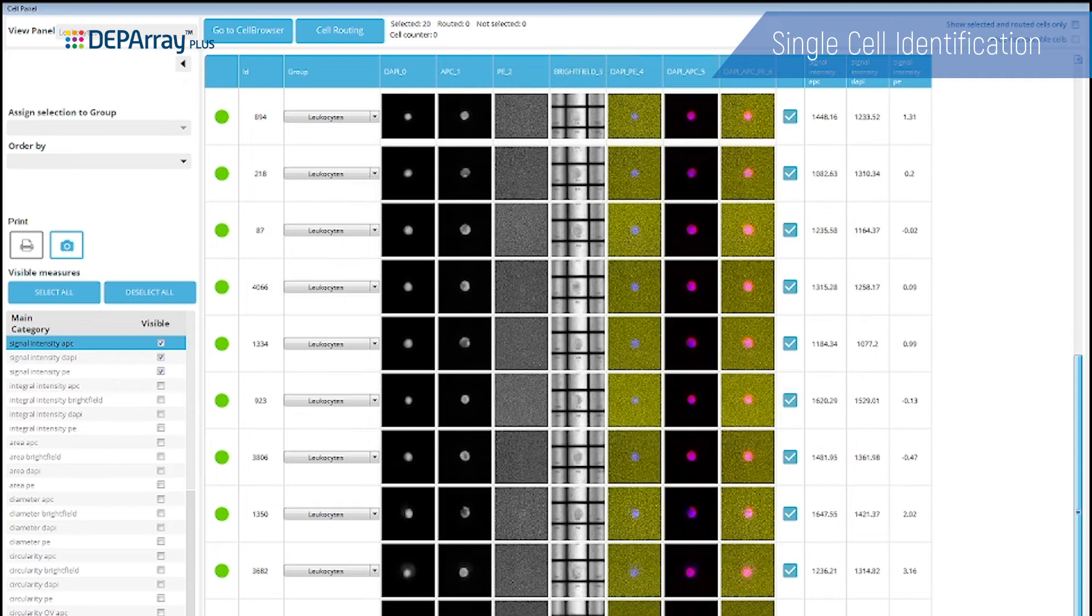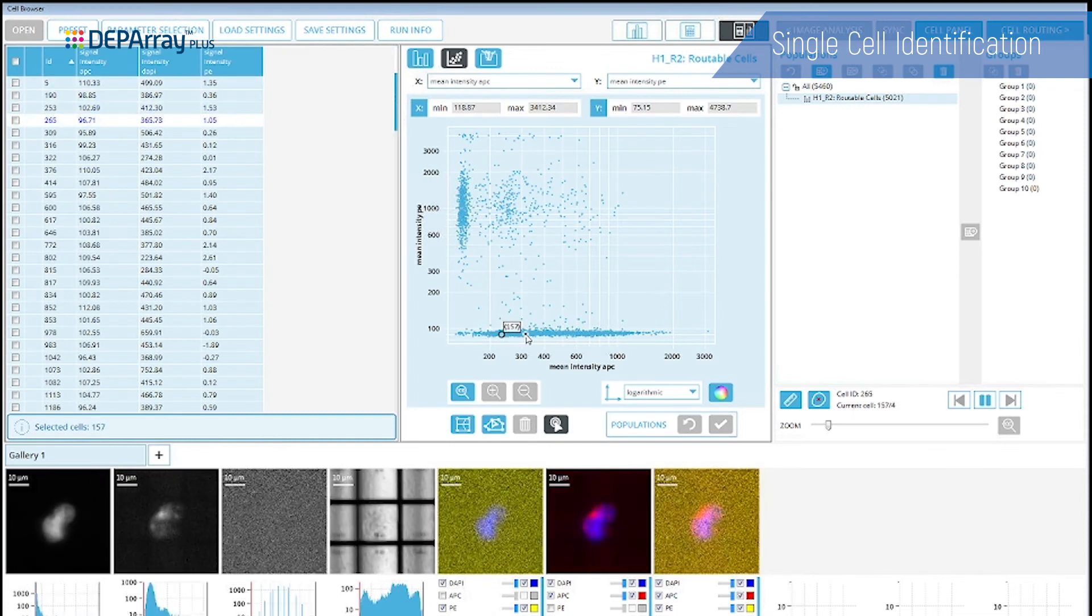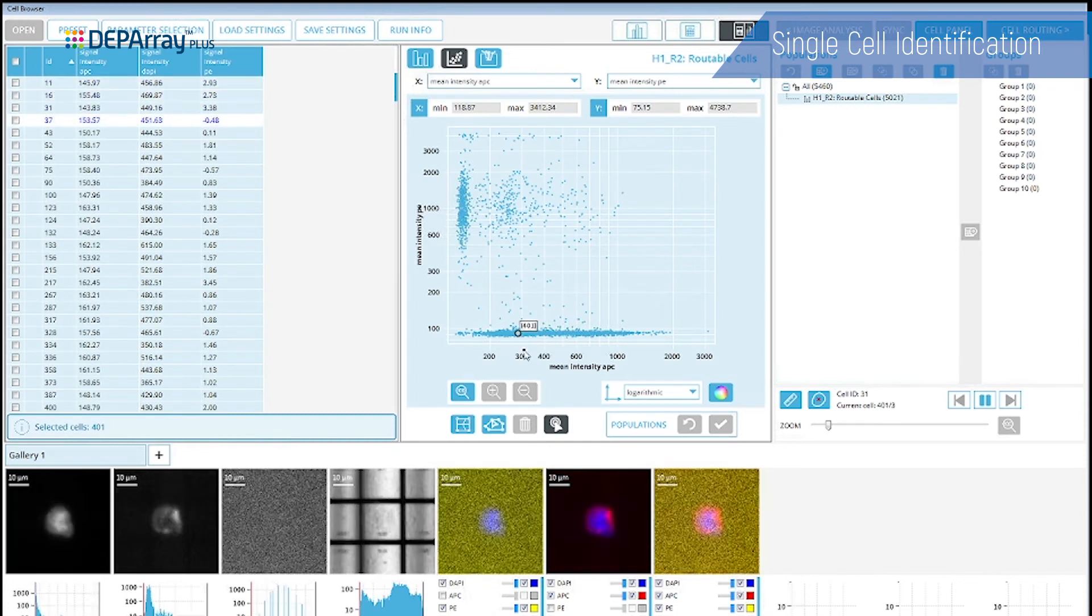Each individual cell image can be reviewed using the Cell Browser software, a powerful tool enabling selection of multiple cell populations based on multi-parametric fluorescence and brightfield criteria.